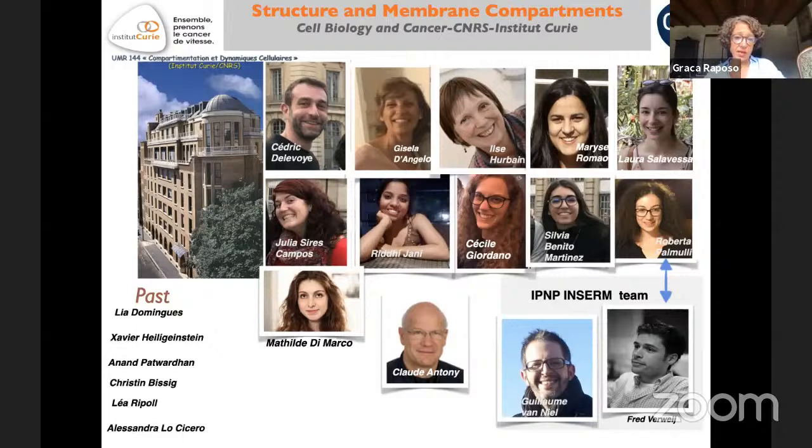And you can immunolabel in your pellets. But I would recommend looking at the many methods now to do immunolabeling on worms and on Drosophila. We have been working lately more on Drosophila. It's tricky, because then you need to embed only one part of these model organisms.